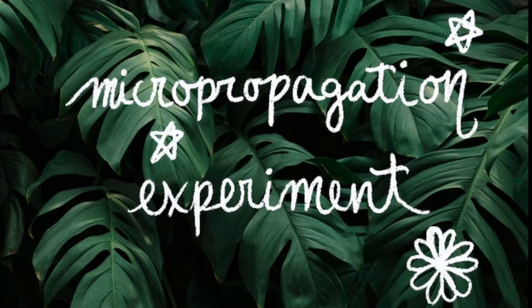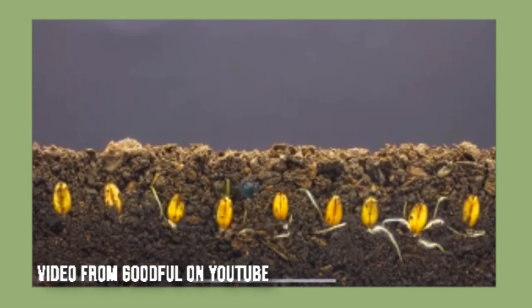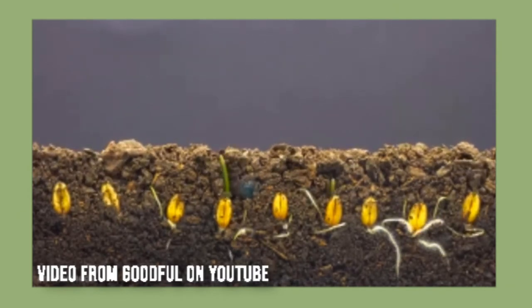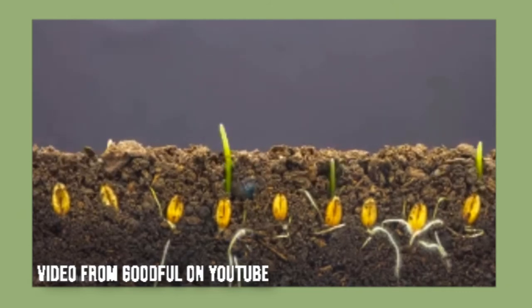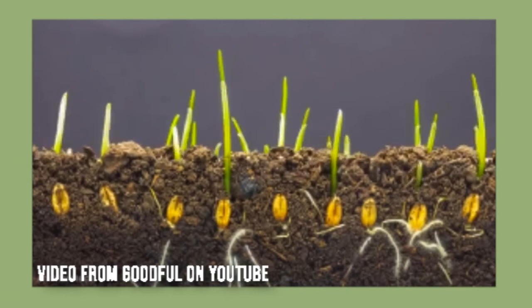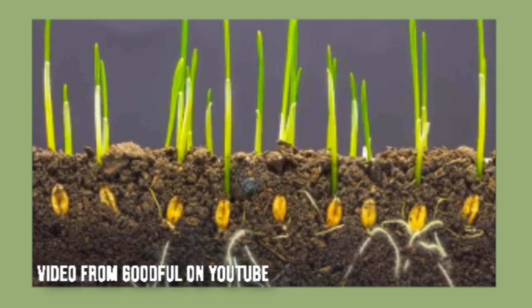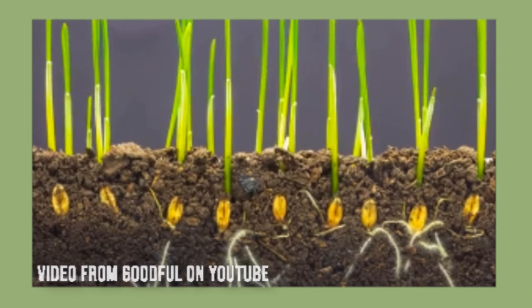In today's experiment, I will lead you through a demonstration of micropropagation using cauliflower. Although you can micropropagate most plants, cauliflower reacts very well. Through this experimental micropropagation, you will also be able to observe and engage with the concept of reproductive cloning, as each new cauliflower plant that you create is a perfect copy of the mother plant it was cut from.